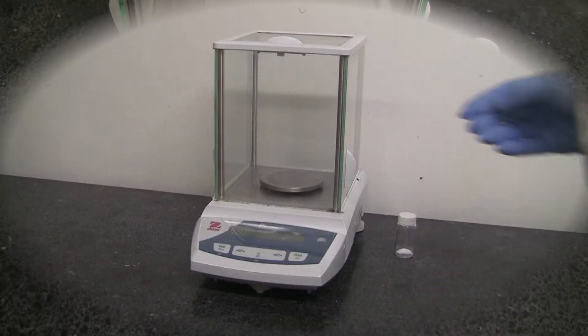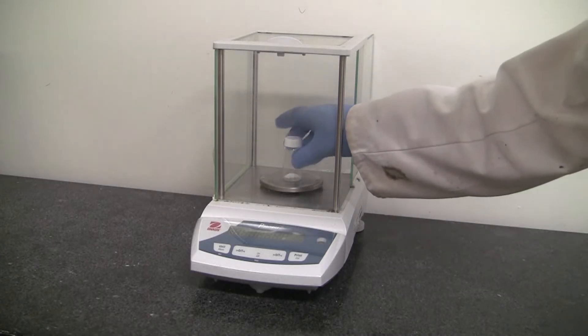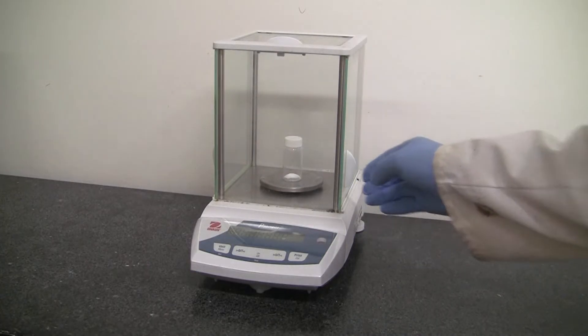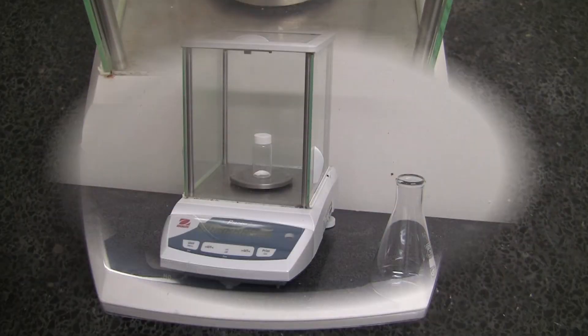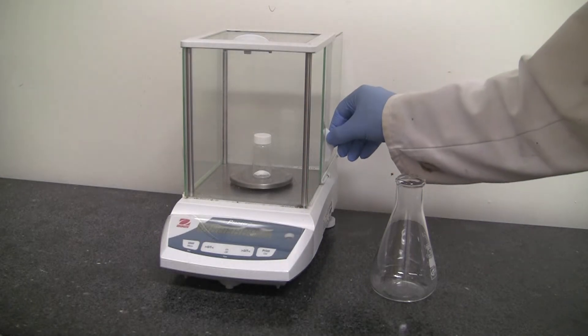Open the door, place your sample in, and slide the door shut. Take a reading of your initial mass, all four decimal places. Once you've recorded that mass, slide the door open.